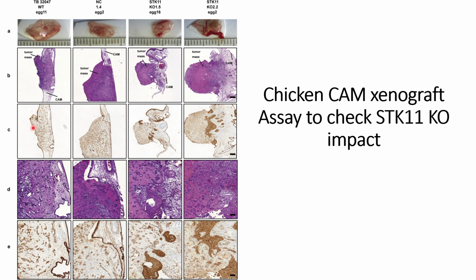Next one is cytokeratin. They use cytokeratins to find out epithelial cell migration, and that is used to distinguish normal epithelial cells from cancer-infiltrated epithelial cells.